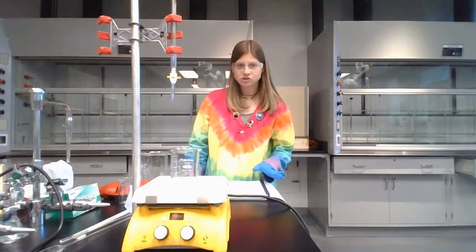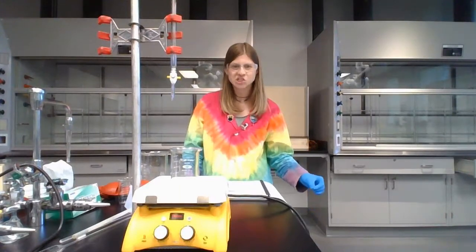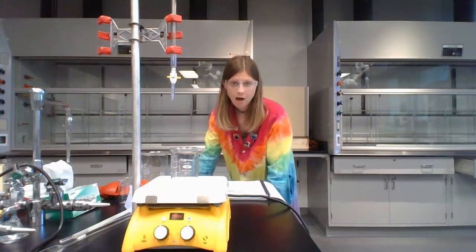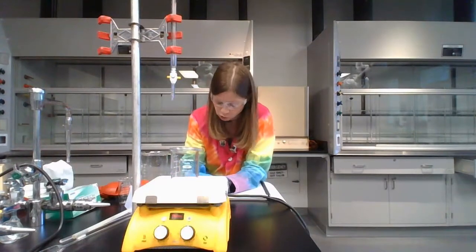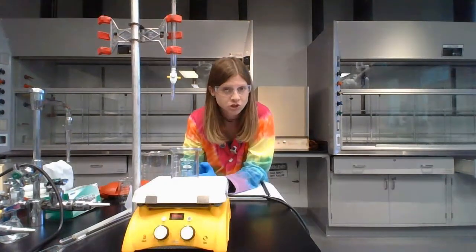So this is the lab lecture of the procedure for the reduction oxidation titration in general chemistry 2. This is the first of our labs that we're really going to be also focusing on safety. The chemicals we're using for this lab are hazardous, and so prior to doing this lab, you'll be reading through safety data sheets, SDSs, and answering questions based on that about their safety concerns.